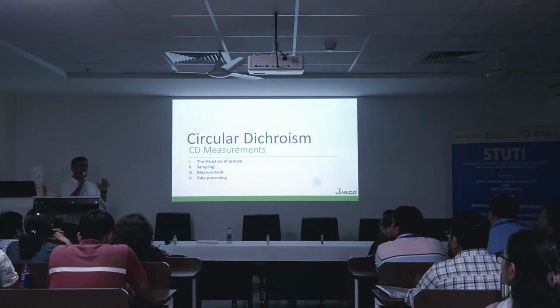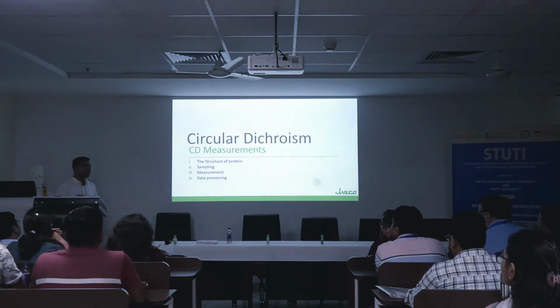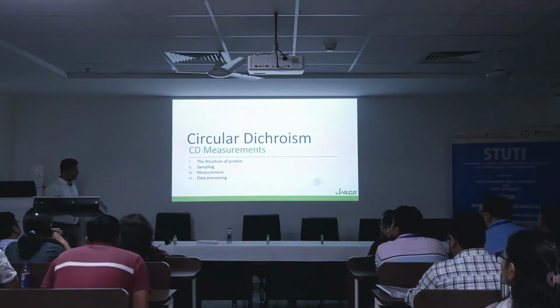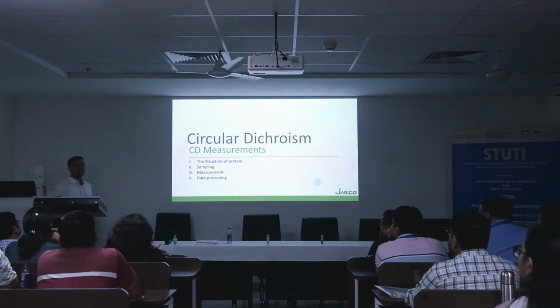For the CD, we have the JASCO, and Spectrum Manager is one of the software we use for taking your sample analysis, right? So there are different measurement techniques and different parameters. So what parameters will be required? Because this circular dichroism instrument, the J1500, is compatible with different kinds of assays.